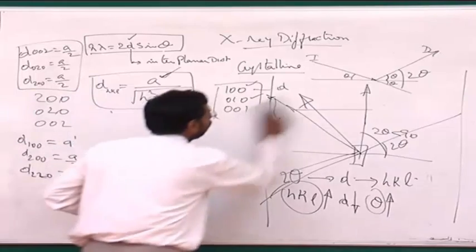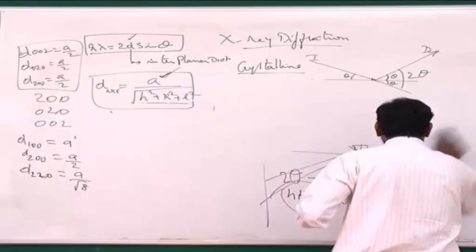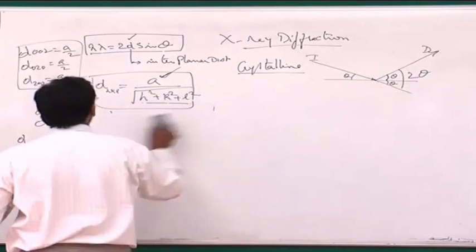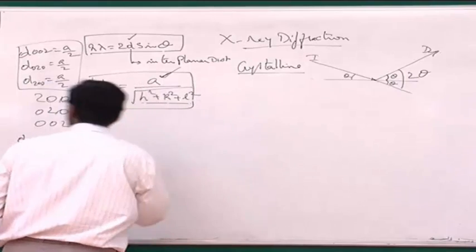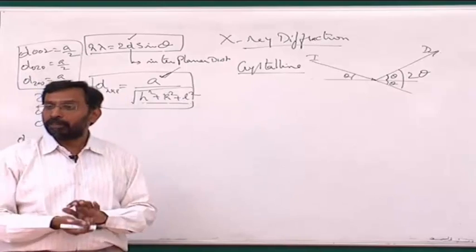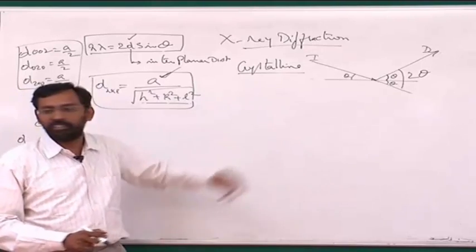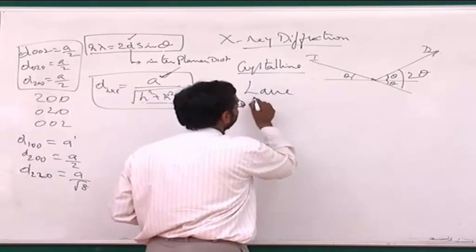And now if you go to the next method, these are all more historical in nature. Nobody other than, I would say, physicists who are dealing with single crystals. There are very few people who actually deal with single crystals. Most material scientists deal with polycrystalline materials with so many grains inside and sometimes even so many phases in it. We rarely even deal with single phase materials. So as a result, the situation is more complicated, and most people do not use the Laue method anymore.